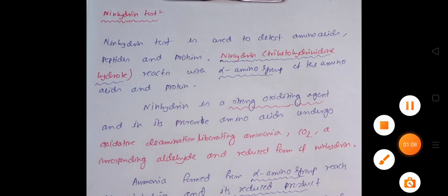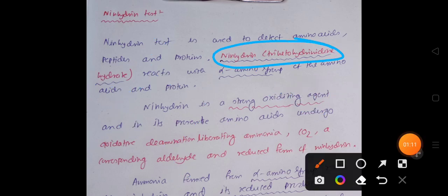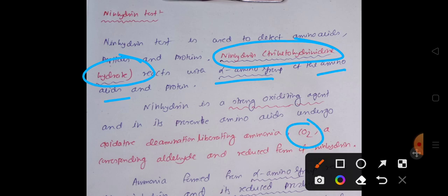First, Ninhydrin, which is triketohydrindene hydrate, is a strong oxidizing agent. In the presence of this Ninhydrin, the alpha amino group of the amino acid will be converted into ammonia, and liberation of CO2 and aldehydes occurs, and the Ninhydrin will be reduced.